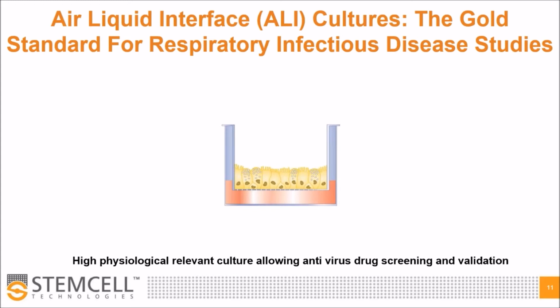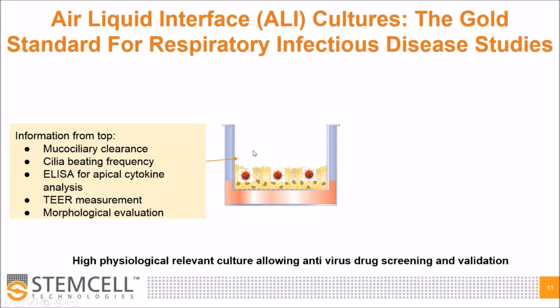As you know, air-liquid interface cultures are model systems based on the generation of monolayers, as you can see in this cartoon. In this culture system, the virus can be inoculated on top of the monolayer generated in the insert of the transwell. And many different parameters can be studied at this point. People can look at the top of the monolayer and get information about mucociliary clearance, cilia beating frequency, perform an ELISA for apical cytokine analysis, perform TEER measurements, and morphological evaluation.